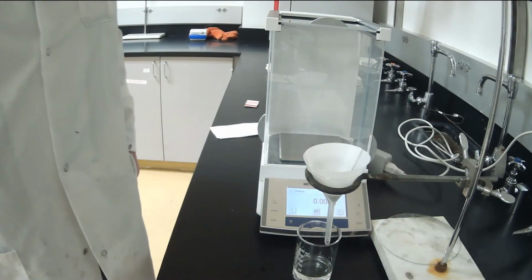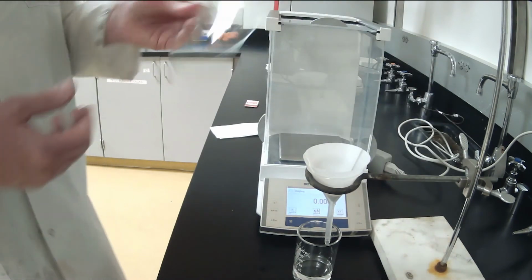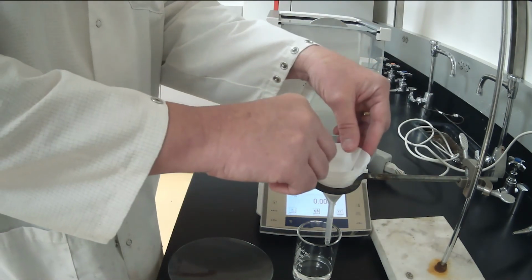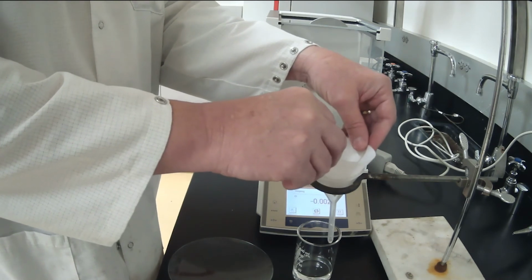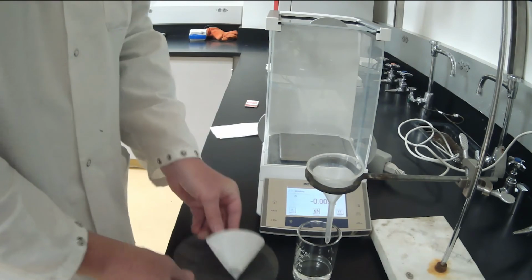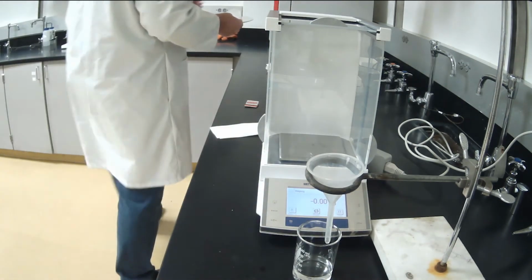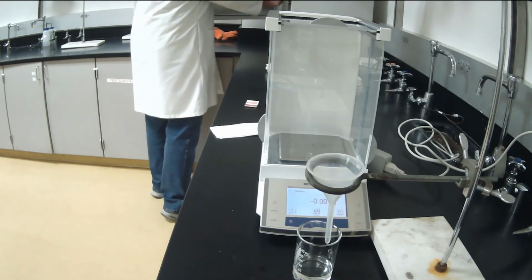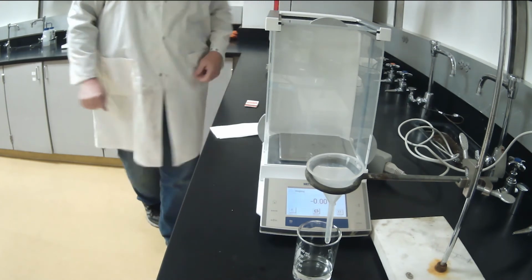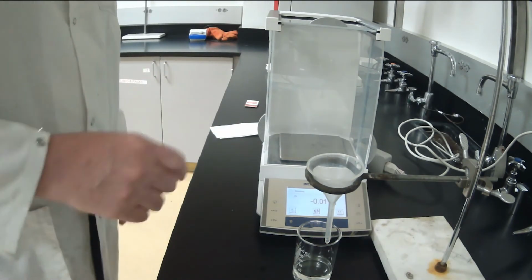Okay, it appears it is finished dripping. So we're going to take the watch glass that we used before. We're going to very carefully transfer the filter paper to the watch glass, like so. We're going to go place it in this oven that's back here in the background. The oven is set at 130 degrees, and it should completely evaporate any water if we give it enough time.